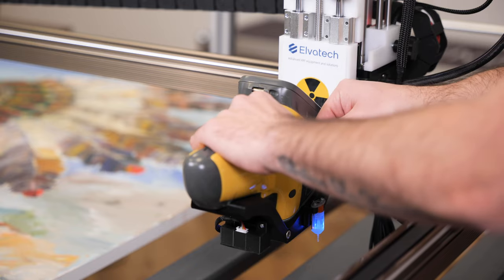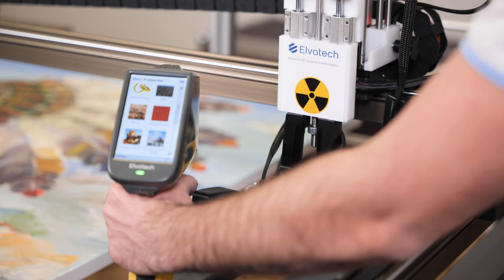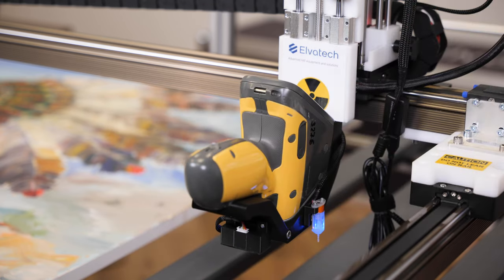We have come to the end of our review of Elvox Art. This system is an invaluable instrument for the analysis of art objects due to its exceptional accuracy, non-destructive method of examination, and ability for detailed analysis. One of its key advantages is the high speed of the spectrometer, which is critical for obtaining accurate results quickly. The integrated Prospector 3 handheld analyzer provides additional flexibility, allowing you to use it both in the lab and in the field. In addition, the Elvox Art offers a lifetime of energy calibration stability, eliminating the need for frequent adjustments and ensuring that it is always accurate. To learn more about Elvox Art and its features, you can contact our managers by phone or write us at the email shown.